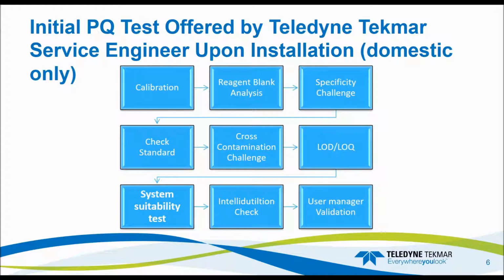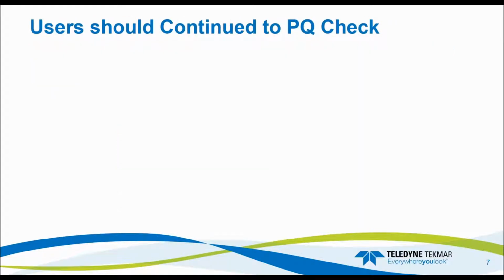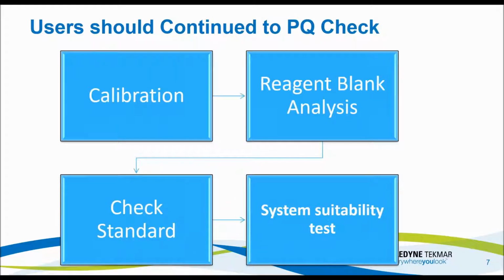And then we do a user manager validation to make sure you can properly assign those permissions we talked about, and then archive validation. But you can also do these tests yourself if you'd like, but we do offer that service from our service engineers if you're interested. And these are the things I suggest users continually check as part of the PQ process.